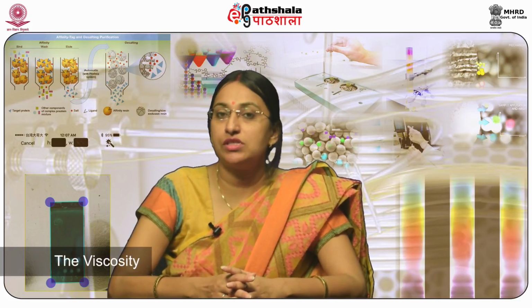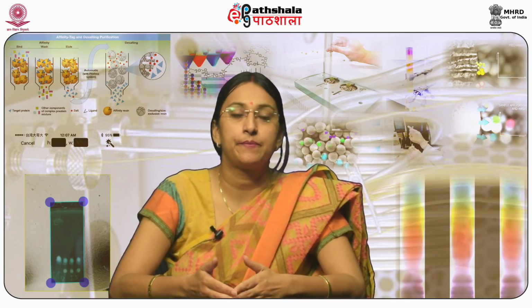Also, the viscosity of the mobile phase may change due to change in its composition, and the pressure may be required to be adjusted to maintain the required volumetric flow rate. The pump that delivers the mobile phase can also be used to mix or blend the solvents.